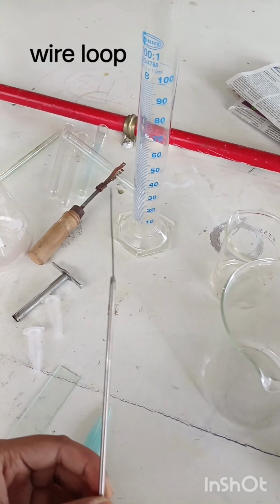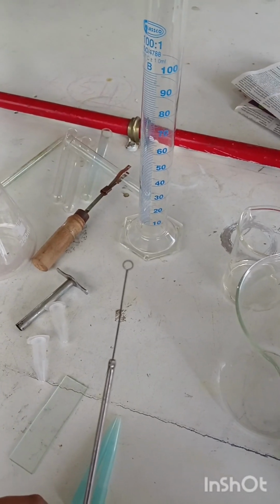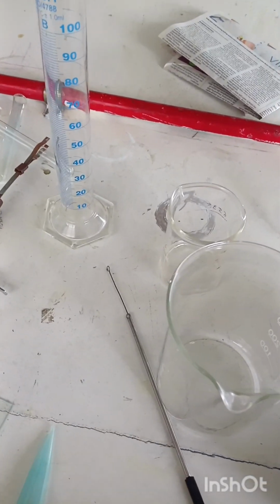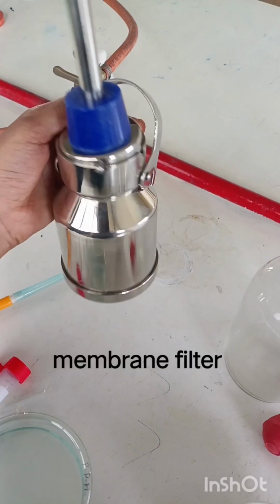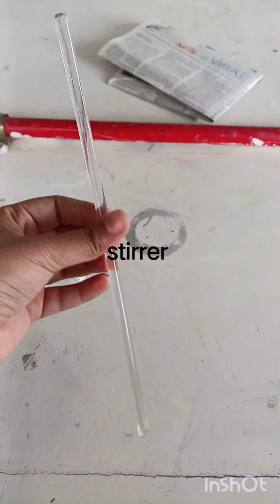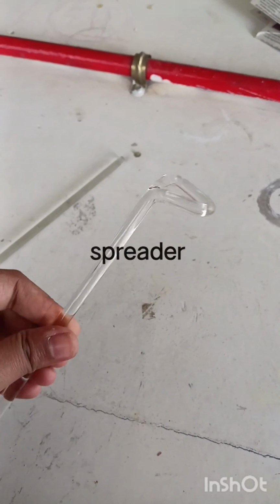This is a wire loop, a tool used for inoculating microorganisms onto culture media, also called a nichrome wire loop. This is a membrane filter, a filter used for separating microorganisms from liquid or air. This is a stirrer, a glass rod used for mixing liquids. This is a spreader, a tool used to evenly distribute microorganisms.